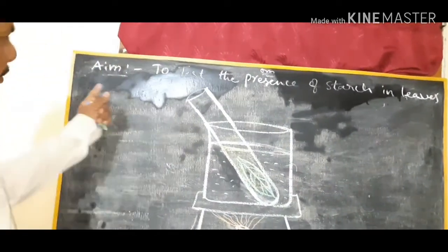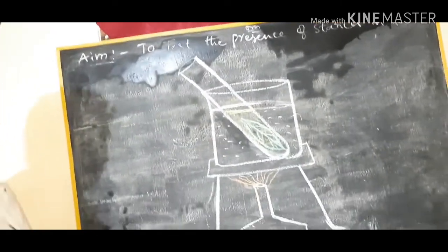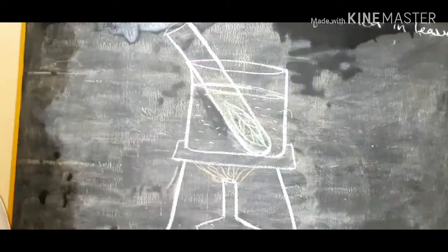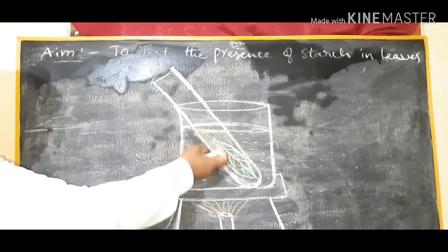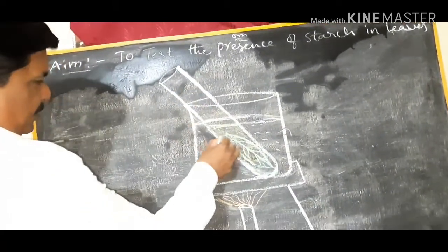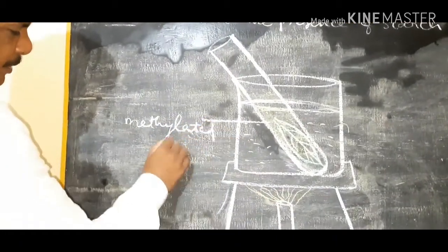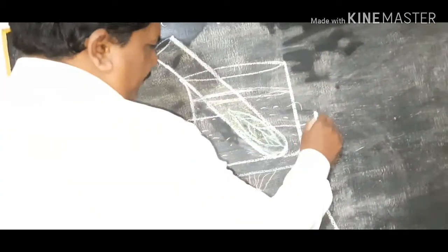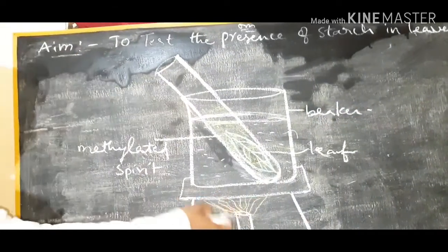Our activity aim is to test the presence of starch in leaves. For this activity, we need the requirements: tripod stand, Bunsen burner, metal sheet, beaker with water, test tube, and methylated spirit or alcohol. This is the leaf we are going to test.